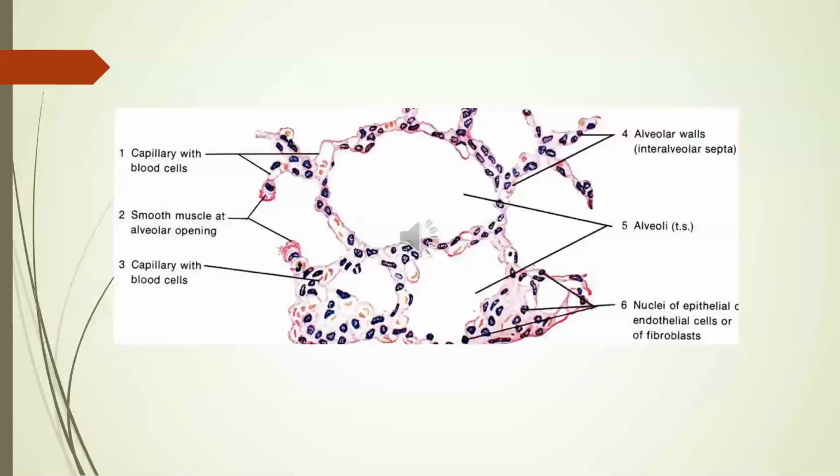The interstitium is formed of continuous blood capillaries, connective tissue cells and connective tissue fibers. Also, alveolar macrophages can be found here in the interalveolar septum. As we can see, some areas of the interalveolar septum are very thin and other areas are thick. The thin area is the place where gas exchange takes place between the blood capillaries and the oxygen in the alveoli.